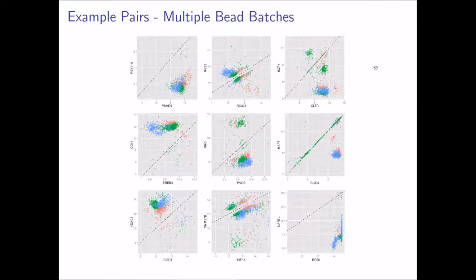So could I ask, were these different bead batches done on the same cells at the same time, or were they done on different days? I believe they're done different days. There are different plates and different batches.